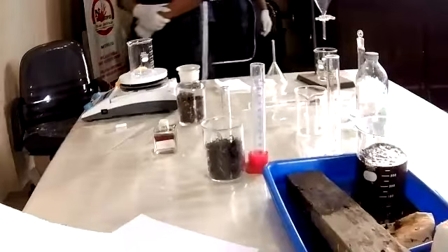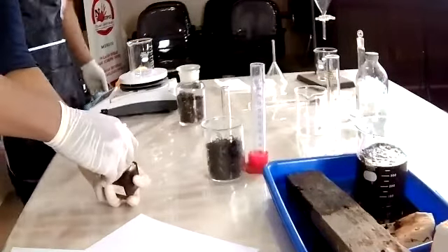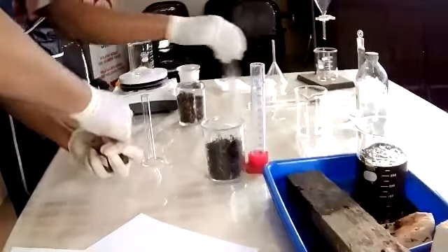And I'm sure you can always find a lot of journals or reports or scientific papers on this. And now we're going to show you how to extract eugenol from the clove extract. So this is the clove oil or the clove extract.